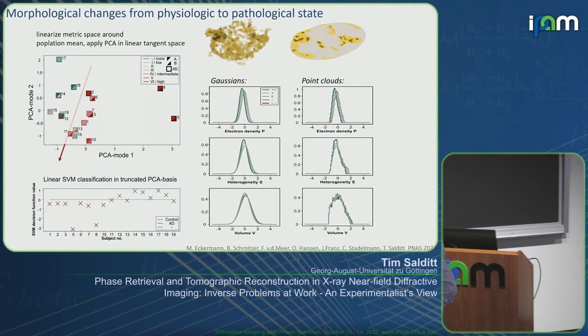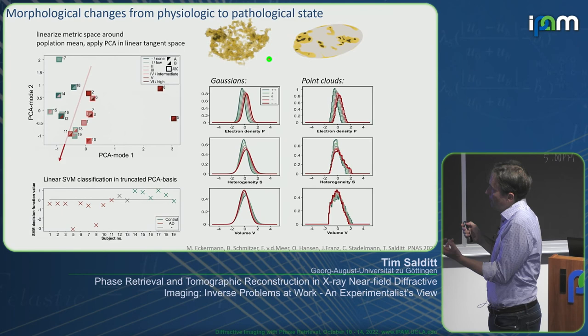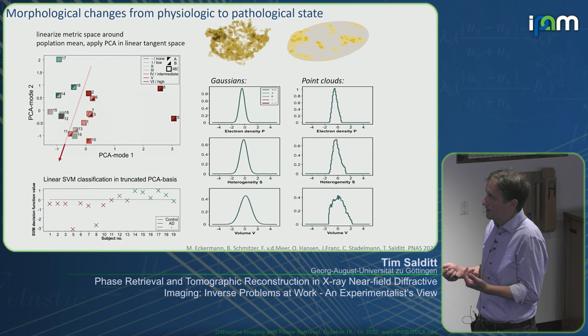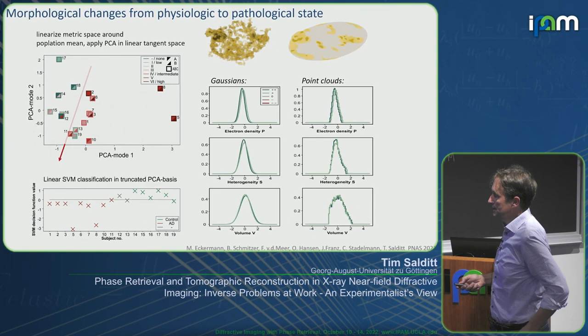What we see here is represented by these histograms. We can see that the nuclei shrink, become more compact and more heterogeneous. And we interpret this by, let's say, an increased number of heterochromatin versus euchromatin. So the cells go into a senescence state. Yeah, and this is completely new. It wasn't a hypothesis when we started, but it came out of this analysis.